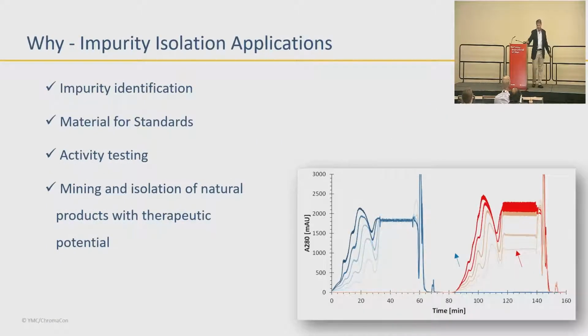Why would you even need to do impurity isolations? That has to do with the drug development process. It works for biopharma, small molecules, peptides, oligos. Everybody needs to characterize the impurities that are left in their material at the end.